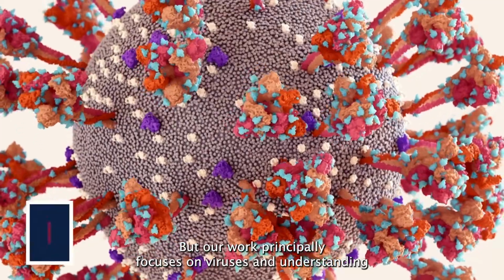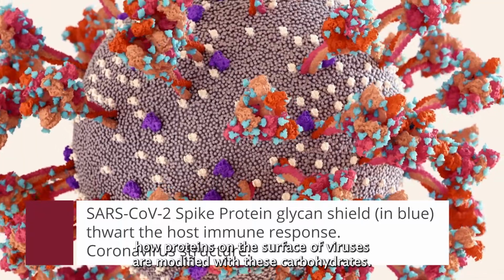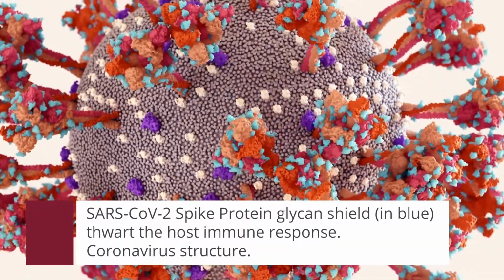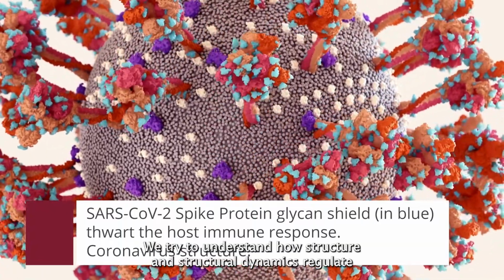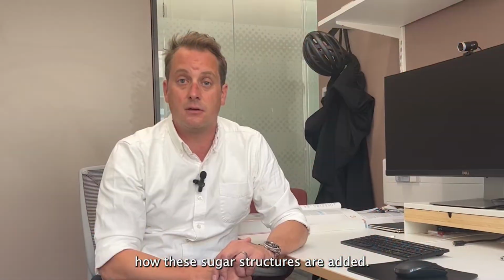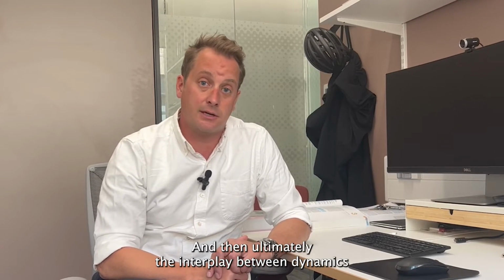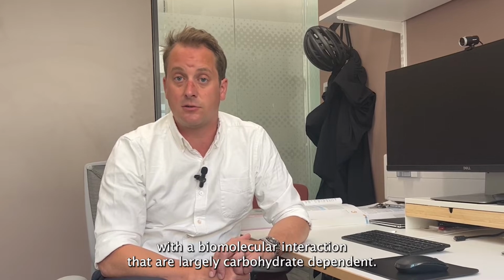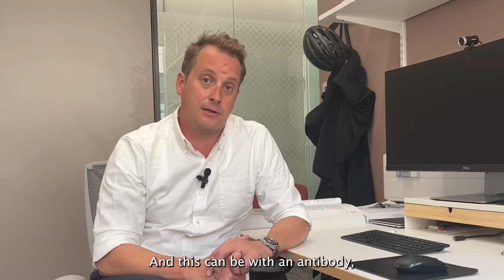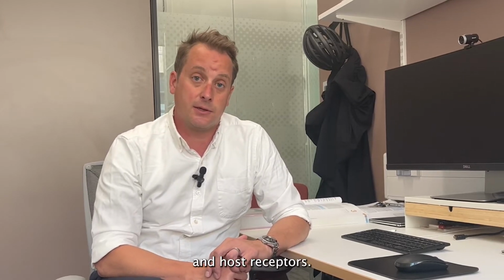But our work principally focuses on viruses and understanding how proteins on the surface of viruses are modified with these carbohydrates. And we try to understand how structure and structural dynamics regulates how these sugar structures are added, and then ultimately the interplay between dynamics and biomolecular interactions that are largely carbohydrate dependent. And this can be with an antibody, an immune cell, a carbohydrate binding protein on immune cells, and host receptors.